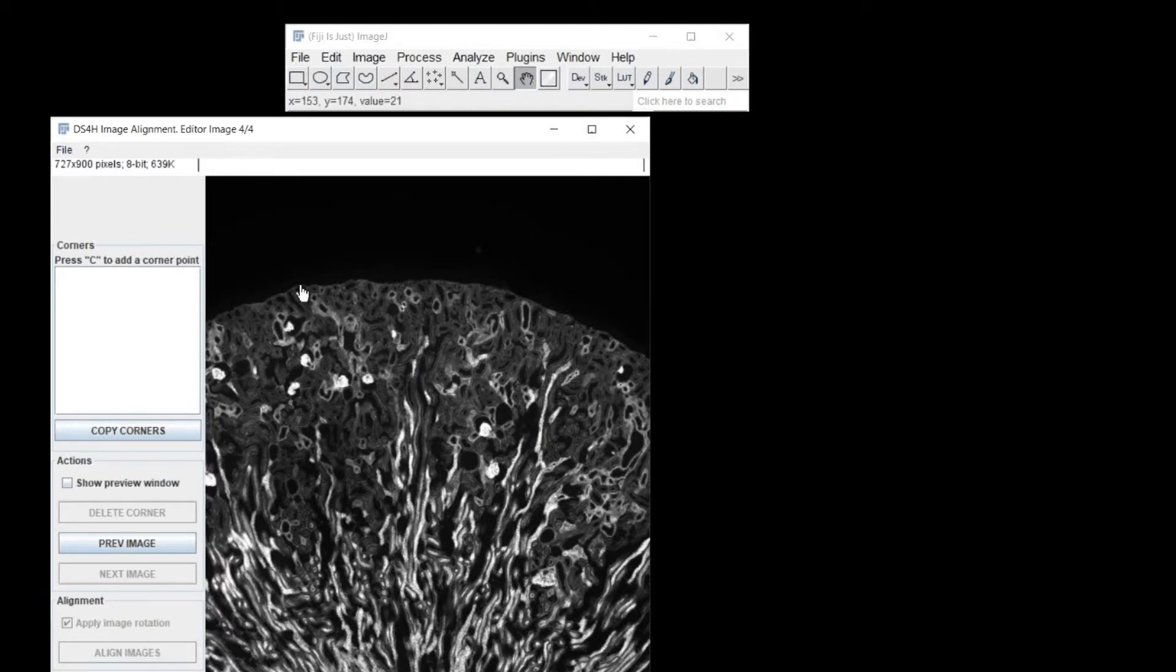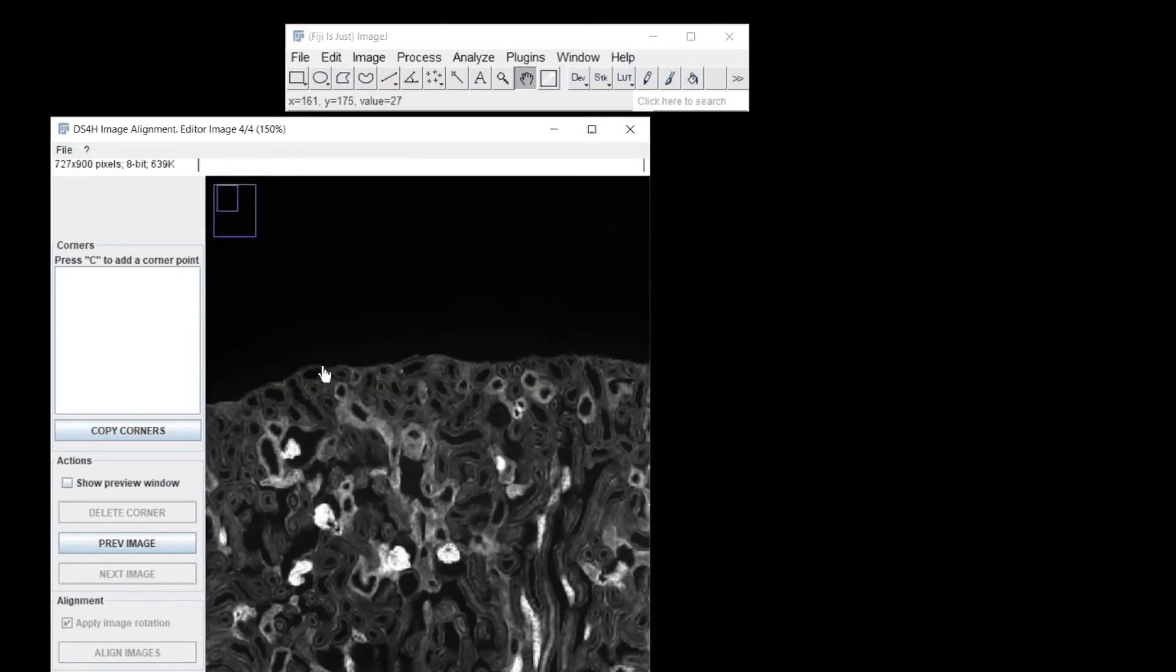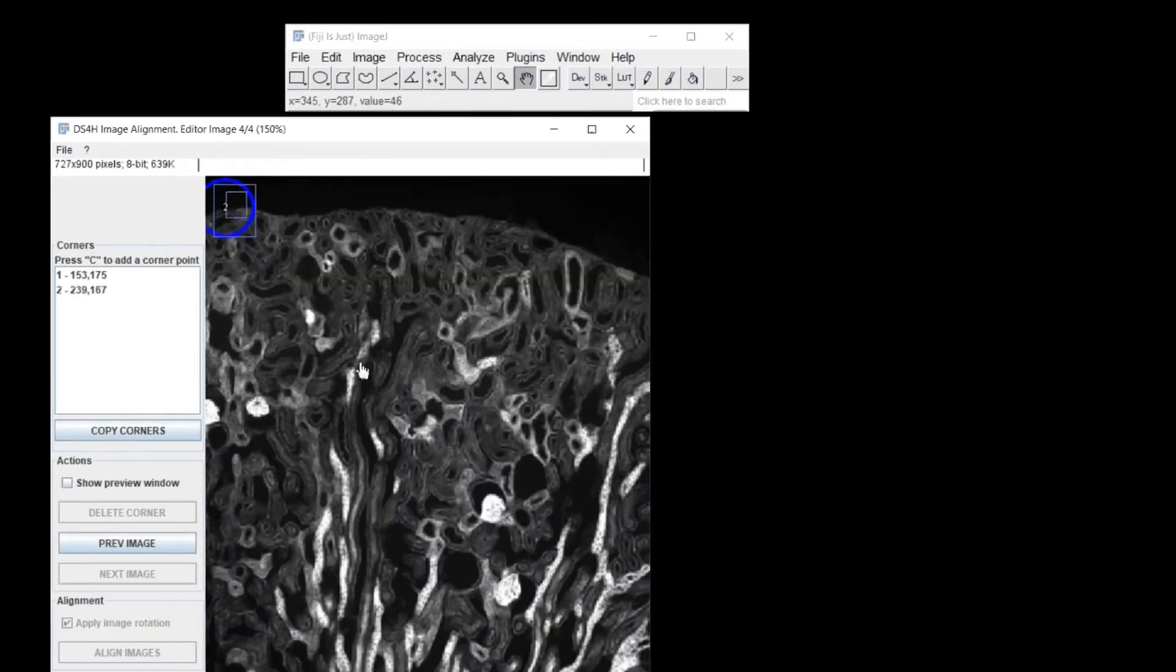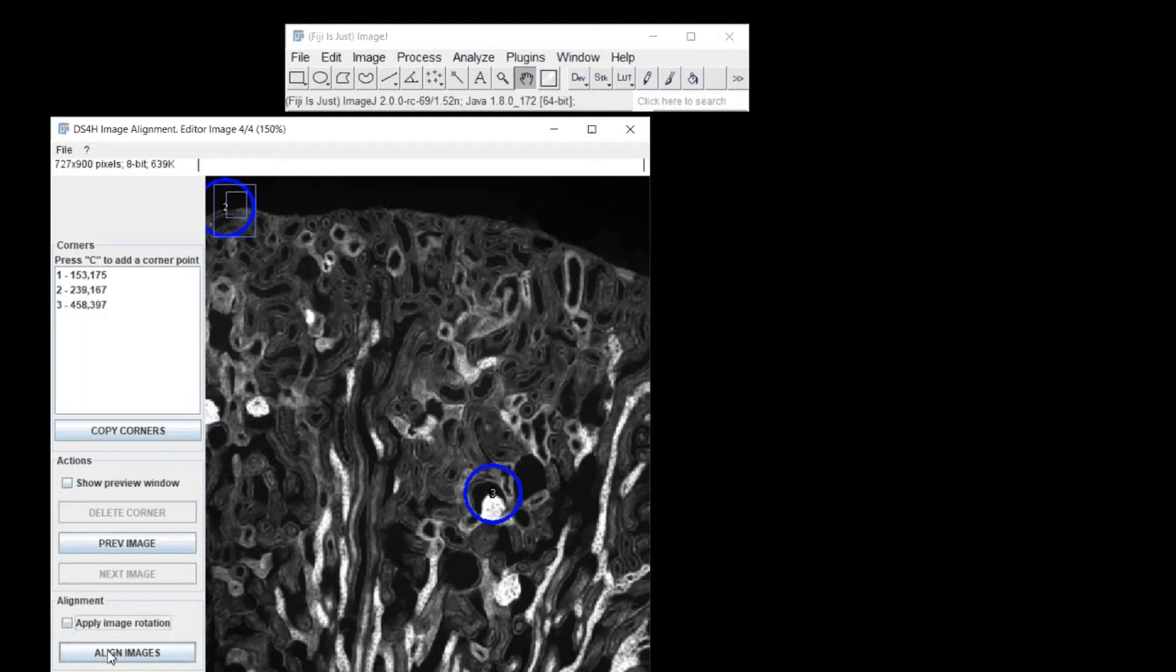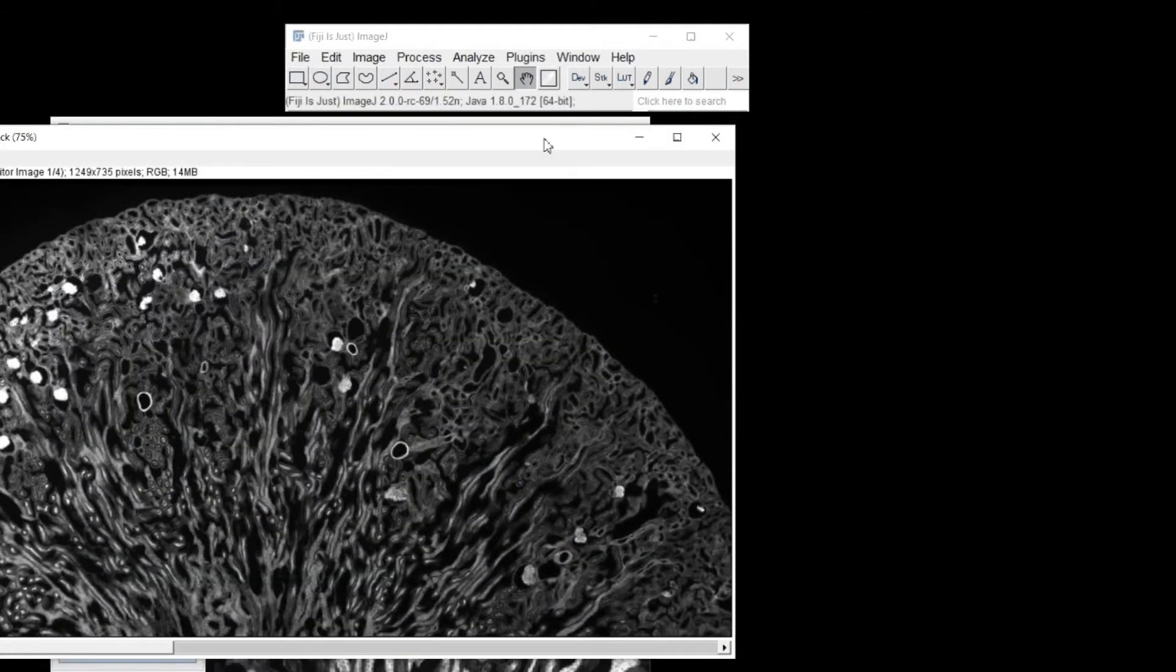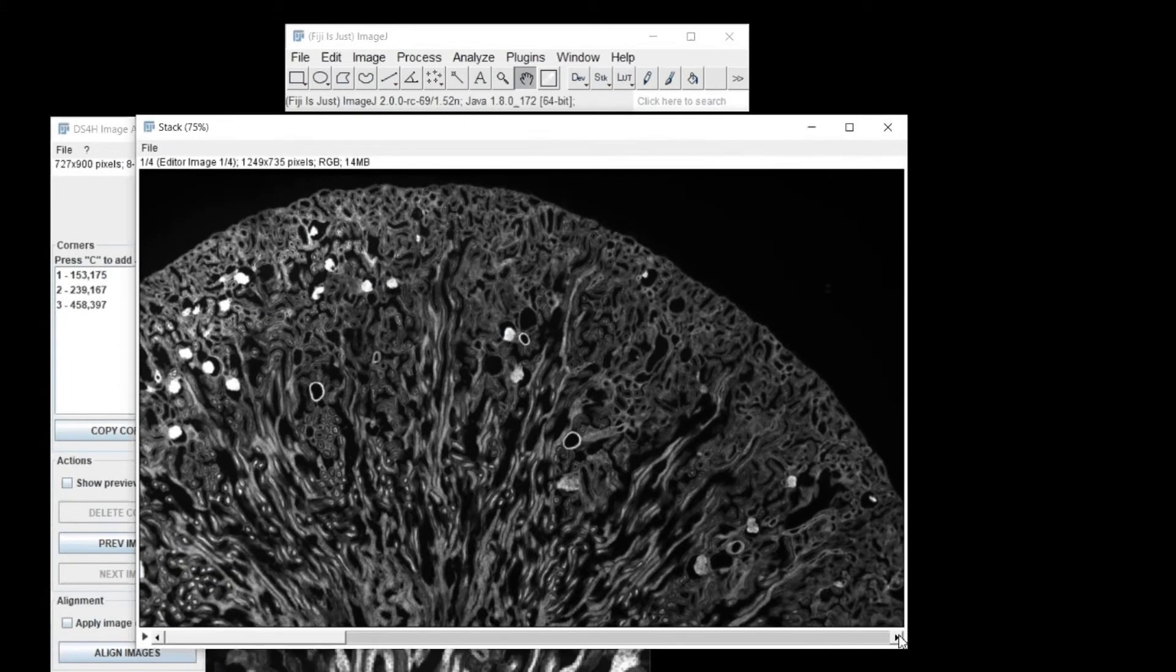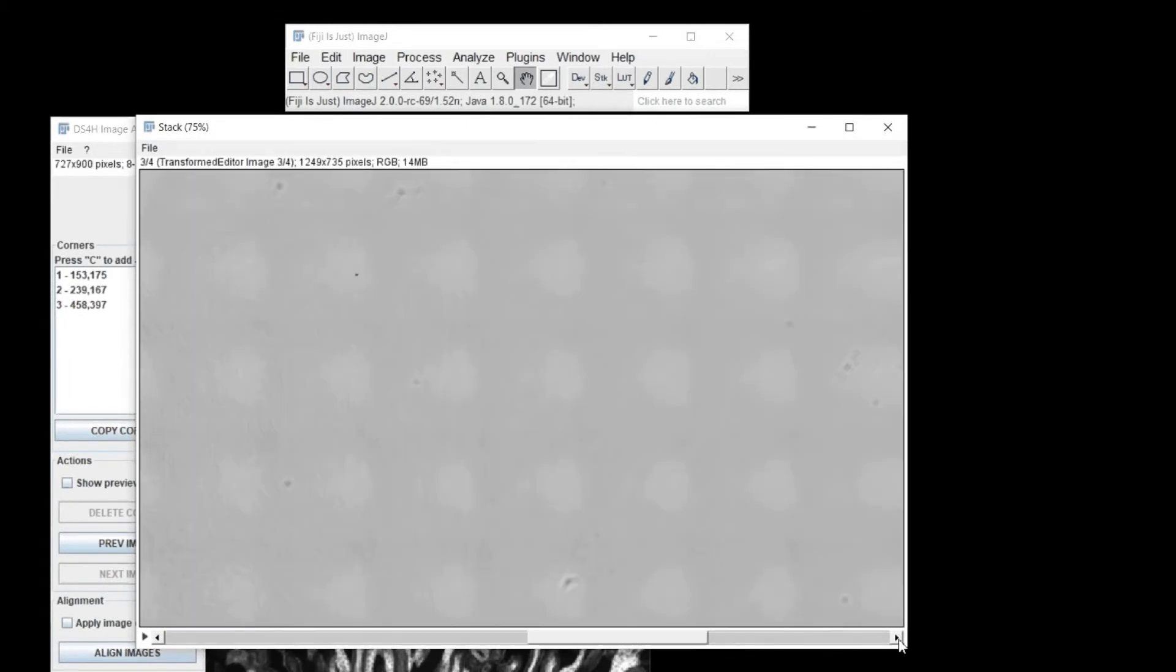Once you have defined at least three corners for each image, click on the Align Images button. For microscopy datasets, it's convenient to disable rotations because the holder of the microscopes typically moves just in X and Y directions.